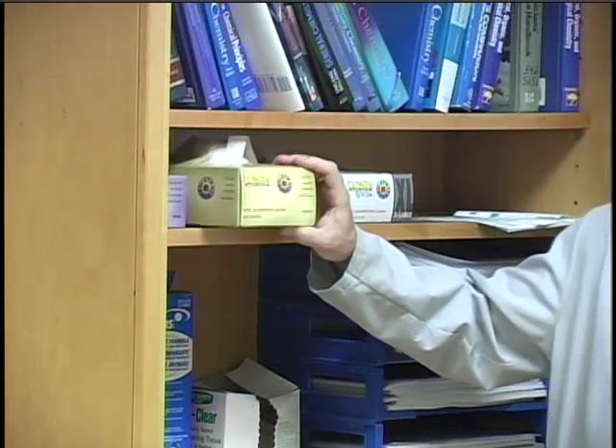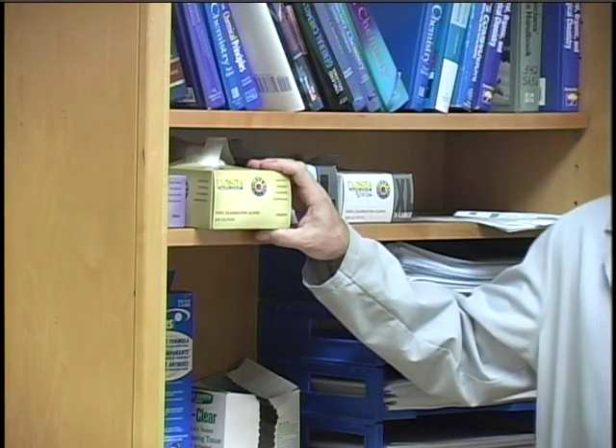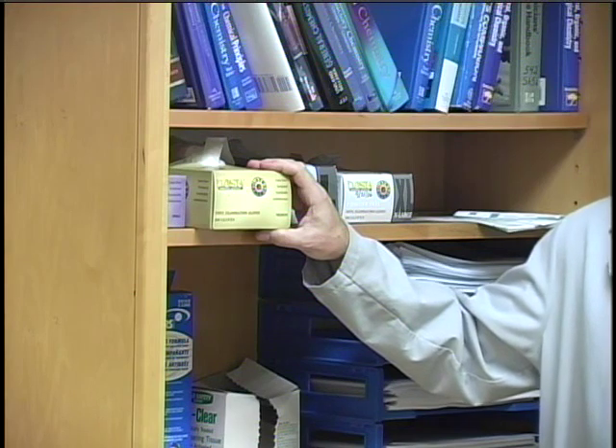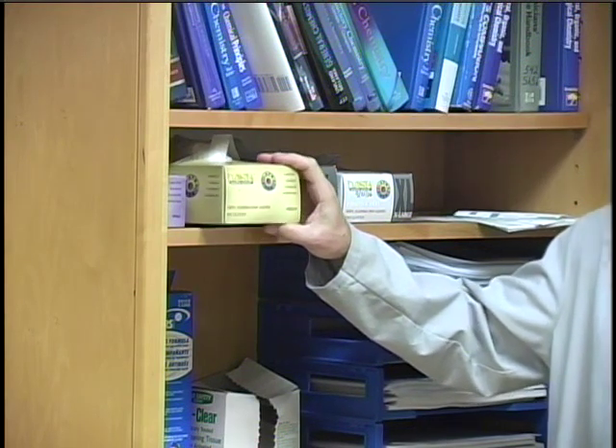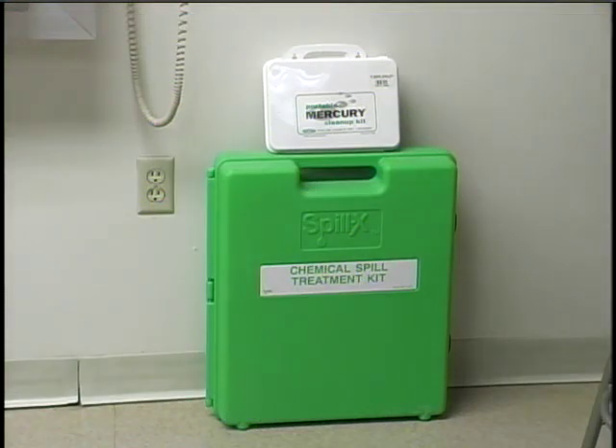Disposable vinyl gloves are also available in the laboratory. Their use is optional for most experiments, but if you had a cut or something like that, it would probably be a good idea to wear them that day for extra protection. Some chemicals such as mercury, strong acids or bases, and volatile organics need special cleanup. The lab has spill cleanup kits that have special materials to help with the cleanup of these hazardous substances. Your instructor would be the one to use these kits if they are required.